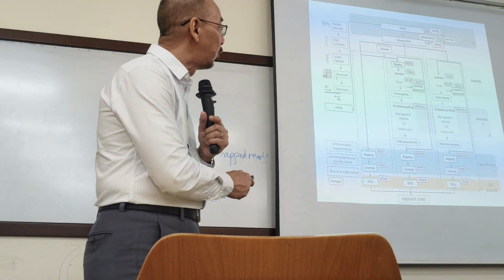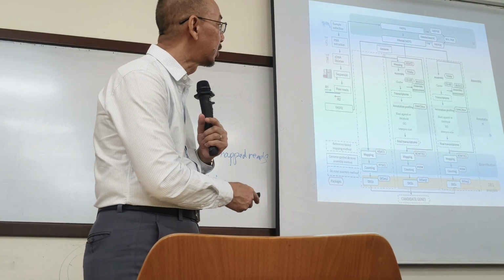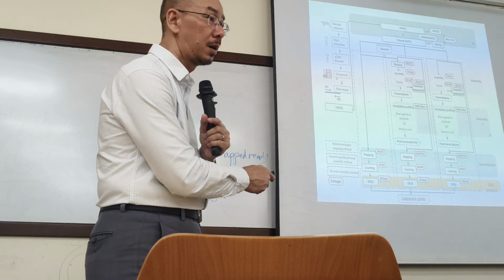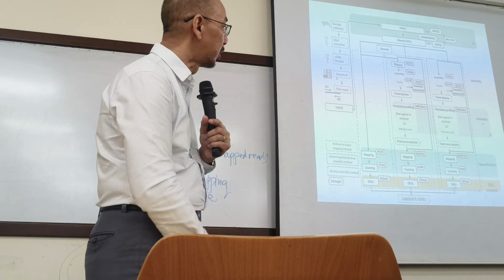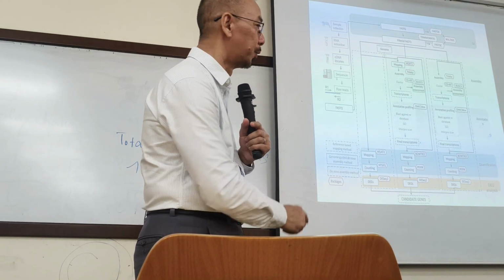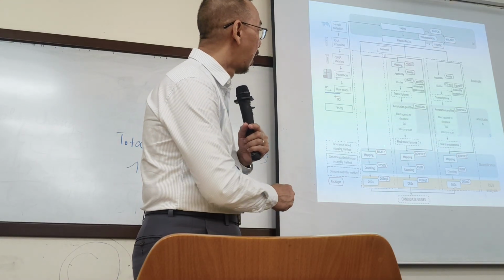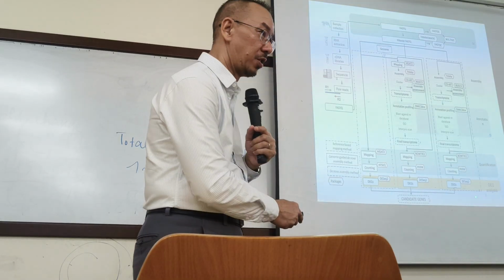When we have the transcriptome, the assemblies, we move further to annotation. Before annotation, we have to check the quality, so that's why we use BUSCO, and then move to annotation. Several annotations here: the first one, BLAST, GO term, InterProScan. Then when we have the transcriptome available, we move to quantification.